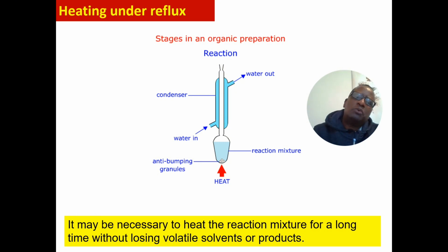Most importantly, you want to think, where have I used the reflux process in my learning? You will recall when you were studying alcohols. Primary alcohol to a carboxylic acid: we added some reagents and we can convert the primary alcohol to a carboxylic acid. We add acidified potassium dichromate. Primary alcohol goes to a carboxylic acid. Secondary alcohols: add acidified potassium dichromate, reflux, and it goes to a ketone. So that's where we've met the reflux apparatus.